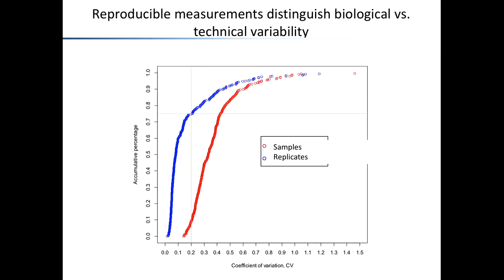So how do we know that? We know that if we do repeat analysis, and this is something which should flow into the experimental design of any such study, we will need to do repeat analysis at the technical level to see what is the variability that is achieved technically. Then if we do a biological experiment, let's say a perturbation experiment, we would be able to say the variability achieved in the biological comparisons is larger than the technical noise, and therefore we see a biologically relevant signal.